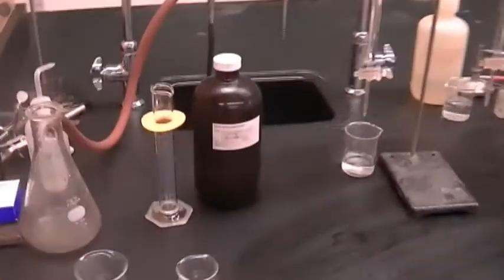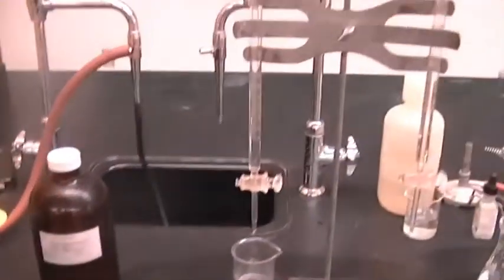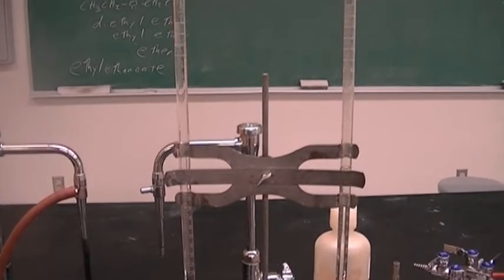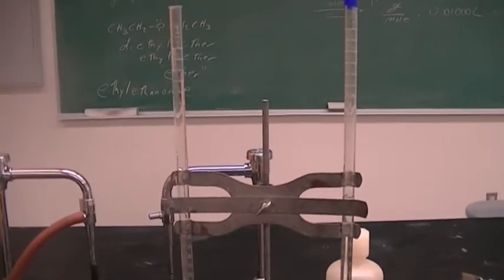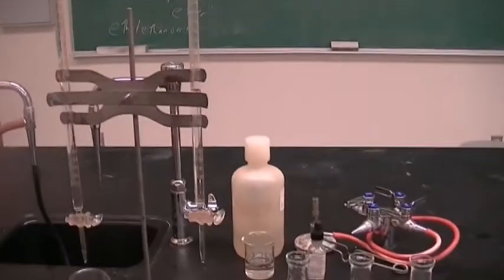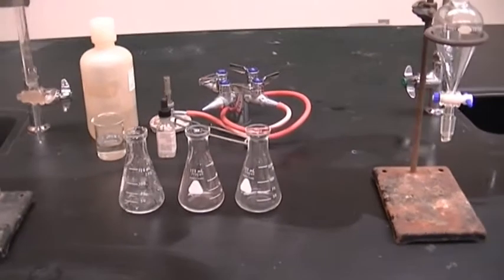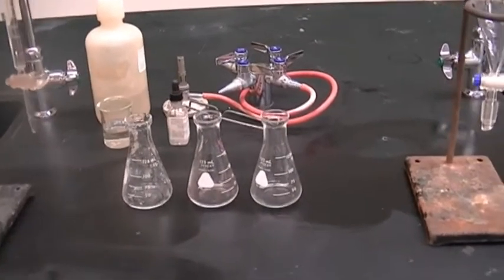All right, so here is our setup. We have our diethyl ether ready here in this bottle. In our burettes, on the left, we have our propanoic acid solution. On the right, we have our 0.083 molar NaOH. We've got our phenolphthalein for the endpoint. We've got our Erlenmeyer flask to do our titrations that everyone is familiar with.